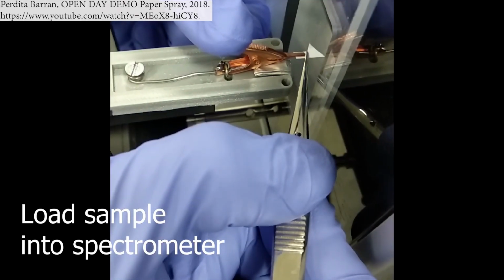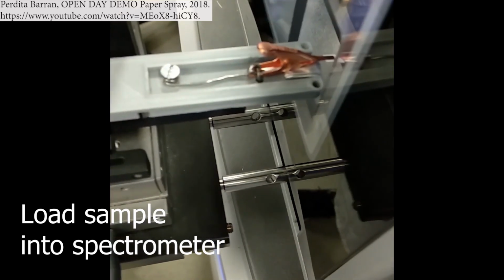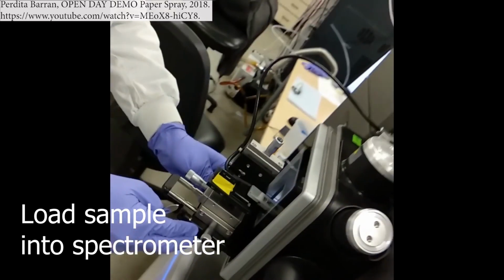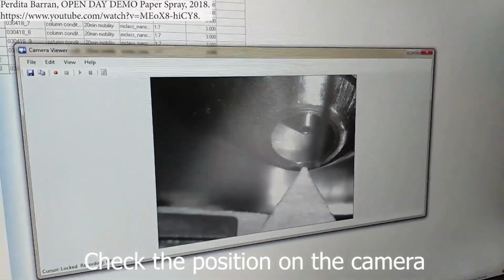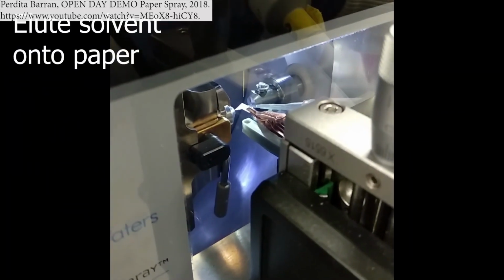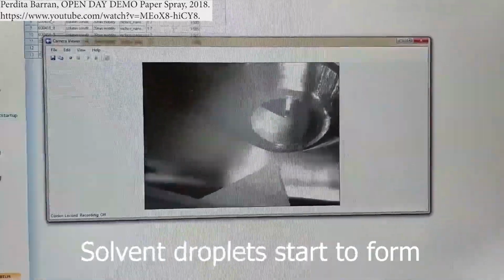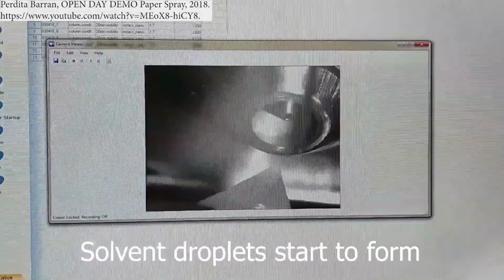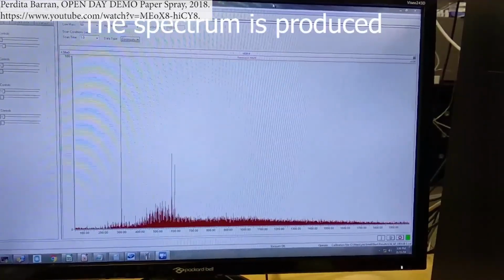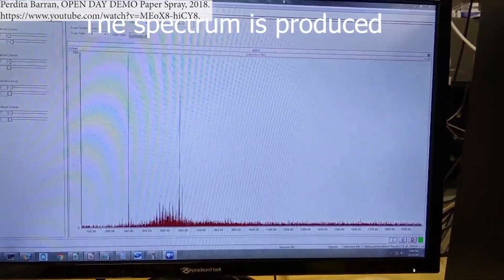of his mass spectrometer. So he puts that clip there, and he can apply 5,000 volts to that clip. So then he inserts that in the source region so he can apply the voltage and be nice and safe. And then you can see in the camera he's got that tip right next to the inlet. He puts on a little bit of solvent there, and that's going to wick the sample, and then he applies the voltage. And in real life, you don't usually get to see the spray. Sorry, he's making the droplets. You don't usually get to see the spray, but he is currently electrospraying into the instrument, and he gets the peaks expected in real time directly from that paper.